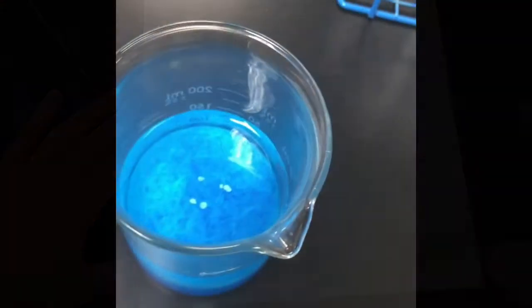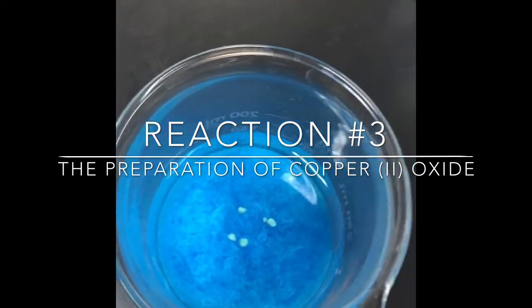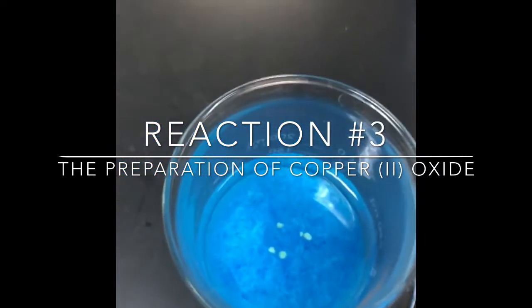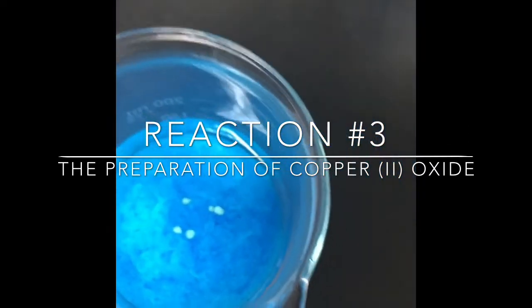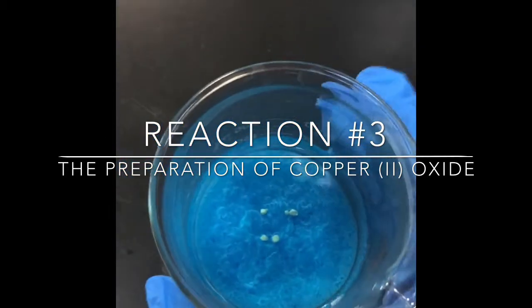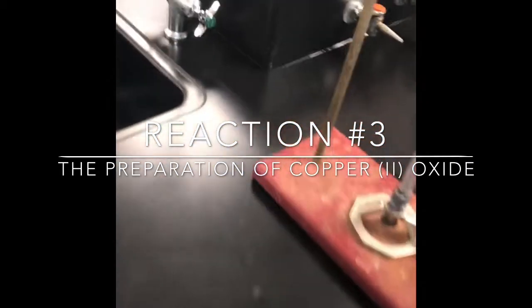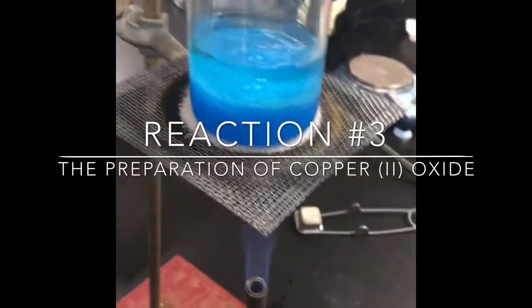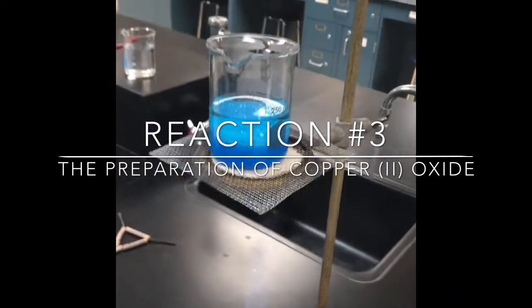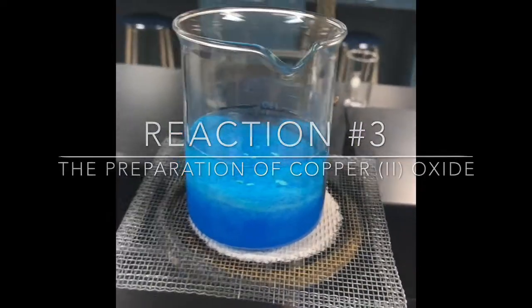Step 3. You see, I added some boiling chips. So those are little pieces of shale that prevent uneven boiling. Okay, they don't participate in the reaction at all. So next, I'm going to put this on my fire, and I'm going to heat it up until it comes to a slight boil. Okay, and there will be a distinct change.